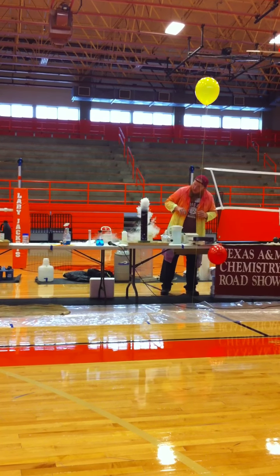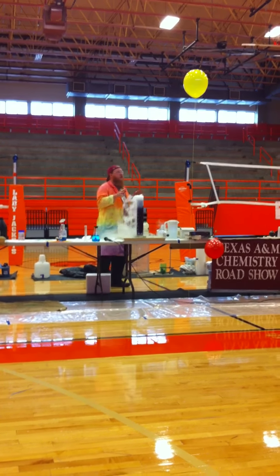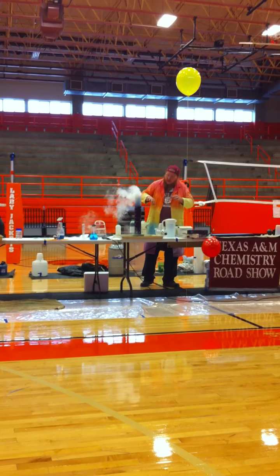It's starting to go a little bit to the blue. Again, it's a little bit dark, it's a little bit harder to see. While this is going, you can actually do a version of this at home. Now, it won't have all the bubbles and everything. Yeah, we got blue going.